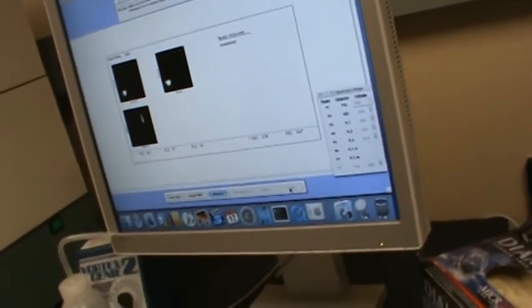So while the unlabeled is working, you're going to do the next set, so the event rate is pretty low. When the event rate is low, what you do, you just add a few more beads to it. Where do you see the event rate? It's pretty low. It's at 2. So I'm going to stop it. What I'm going to do is add 1 more drop of beads.